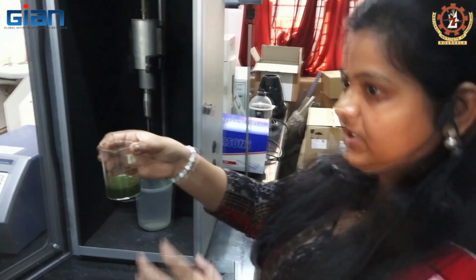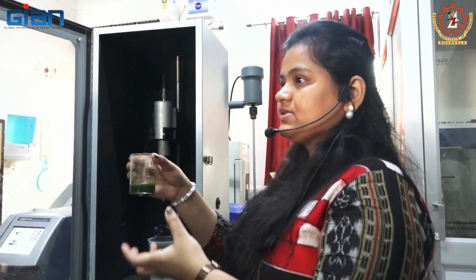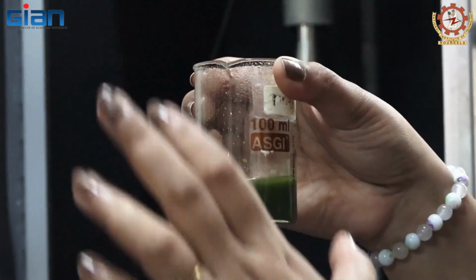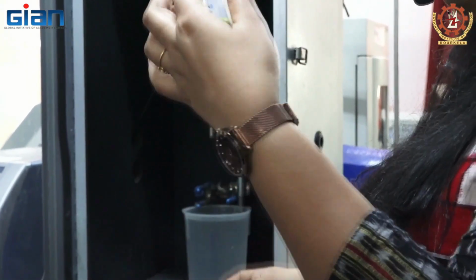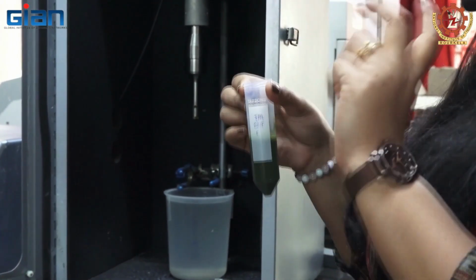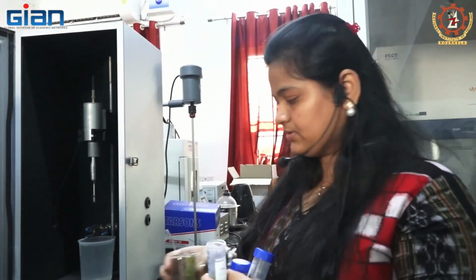You can see that before, the powder had not been dissolved fully, but here it is clearly looking like the bioactive compounds or whatever is in it has been dissolved into the solvent. After this we'll centrifuge, and after that we'll find the clear solution or solvent, and we will extract it, separate the supernatant. Okay, next we'll go for microwave assisted extraction.